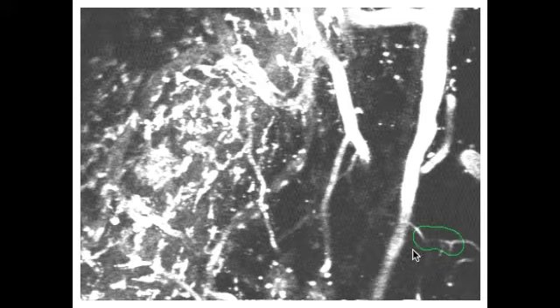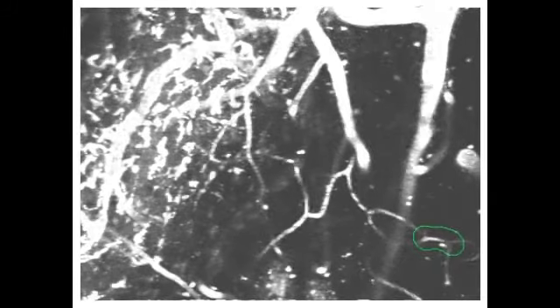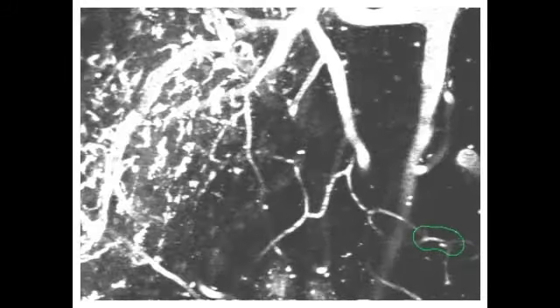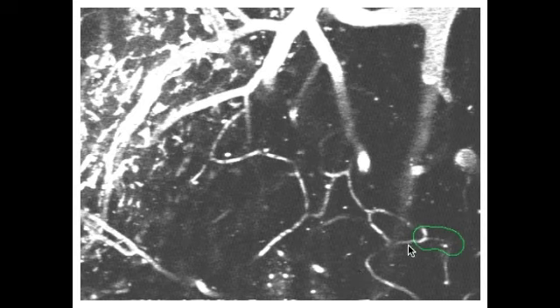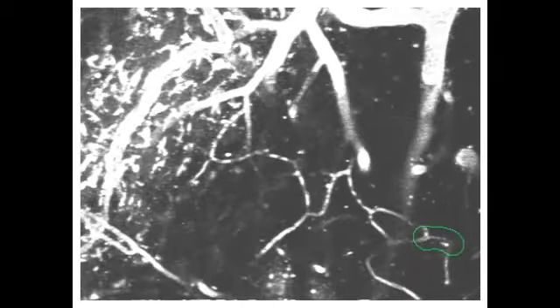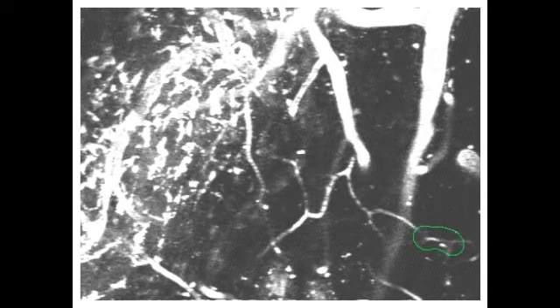The green outline is over here on the bottom right. As we look more closely at this vessel, we can see some motion, and right about here there's a black spot, but it's not really stuck — you can sort of see it passing through the vessel. We don't see any stalls here, so we'll call this flowing.